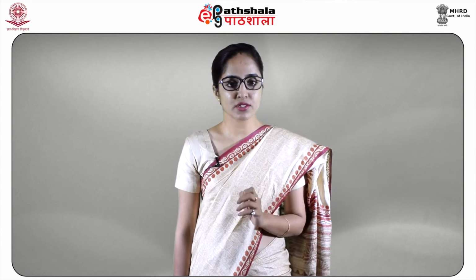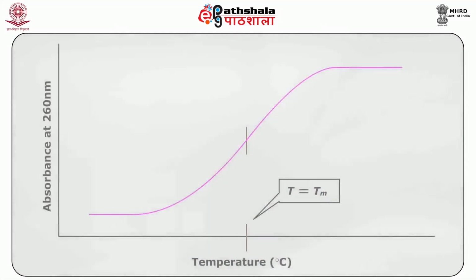The two strands of DNA are held together by both AT base pairs and GC base pairs. Now when DNA is heated, the double-stranded DNA breaks down. Single-stranded DNA, which results, has a greater molar absorptivity at 260 nanometers than double-stranded DNA.